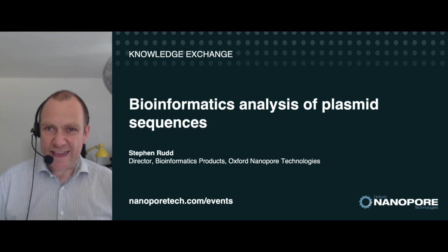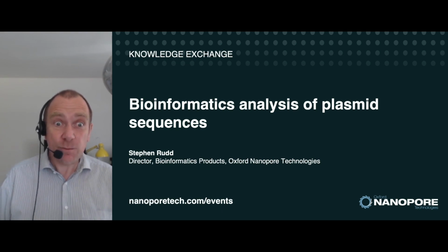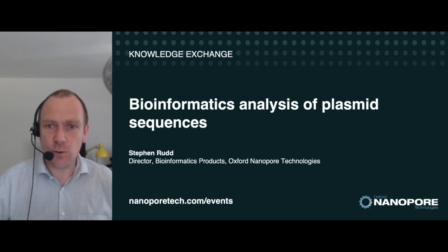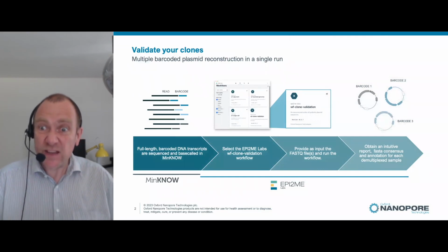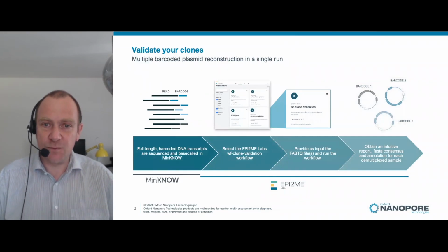So now that we have a collection of DNA sequences, we need to have a little bit of a think about how we're actually going to process the data. What are we going to do? How can we recover a plasmid sequence? So this schematic is really showing the basics of our recommended approach to solving and recovering complete plasmid sequences.